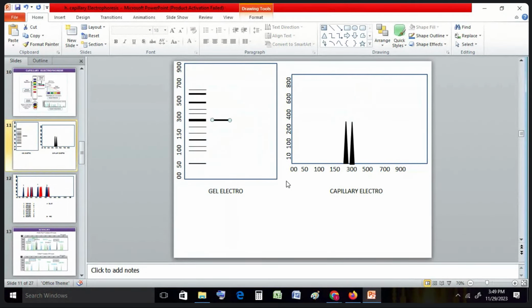You get a single band. Do you understand why there is a single band in the homozygous case? Why are you going to get a single band in homozygous? Both are 20 repeats, sir, that's why. Exactly.